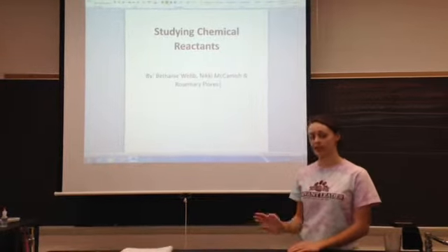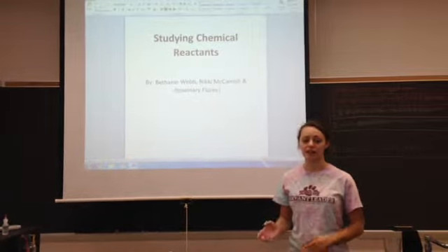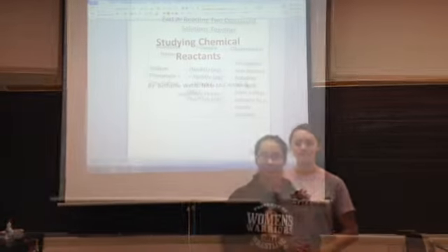So in this experiment that we were talking about, we've taken many different elements that may be combined or already combined, and we've put them together to see what kind of reactions have occurred.